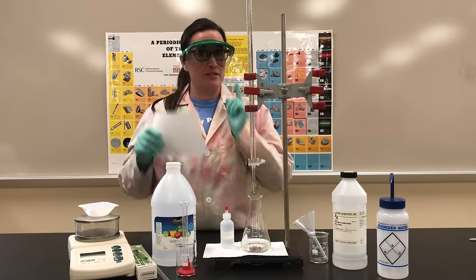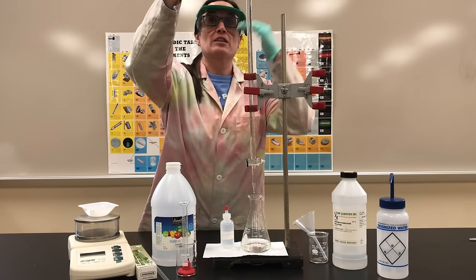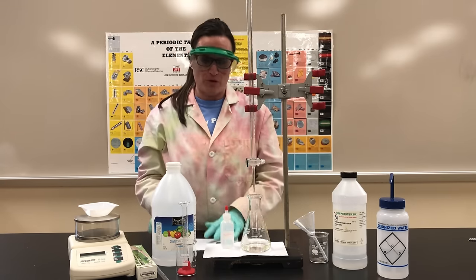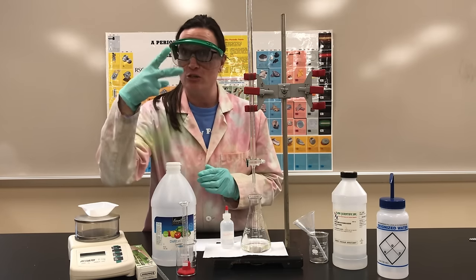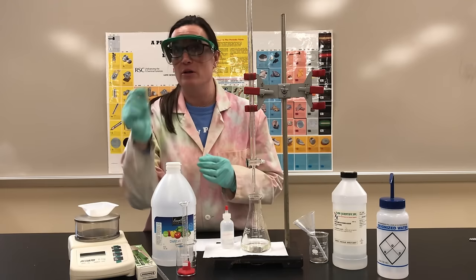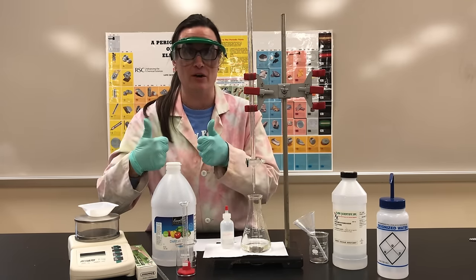Last but not least, take your white paper, put it behind your burette, and read the volume at eye level. Record it in your data table as your initial volume. Make sure it's got two decimal places and milliliters as a unit. Once you've done that, you are ready to go.